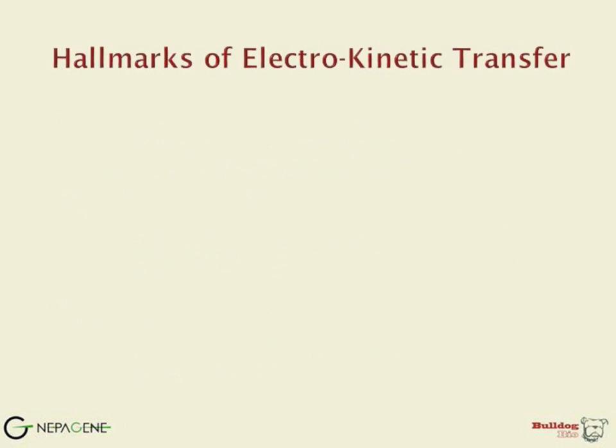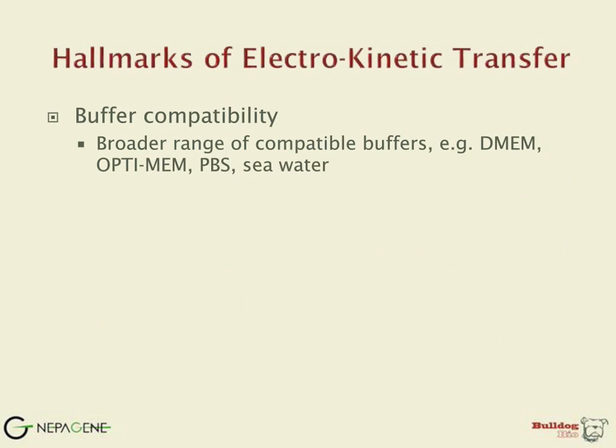So what can electrokinetic transfer offer? Well, first, electrokinetic transfer accepts a broader range of compatible buffers, mostly due to the much lower voltage being applied. Cell-friendly buffers such as DMEM, OptiMEM, PBS, and even seawater are compatible with some systems.